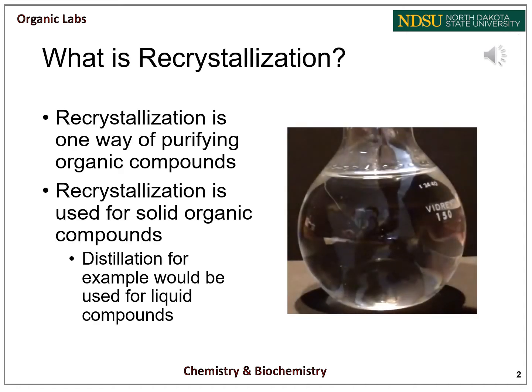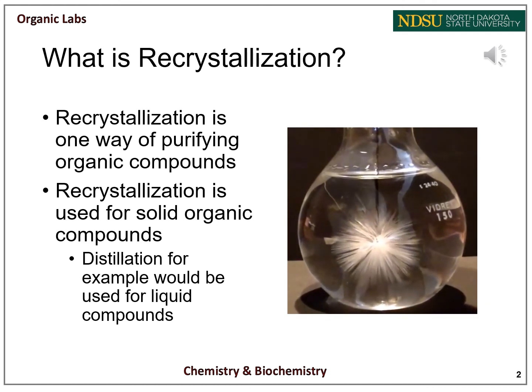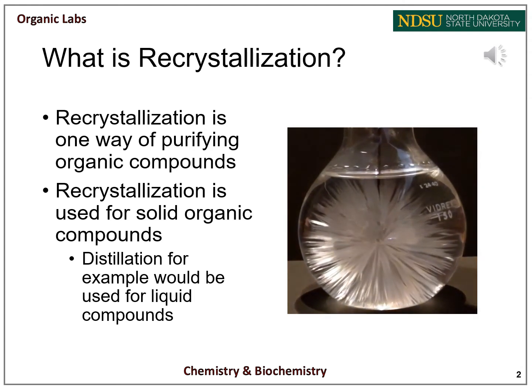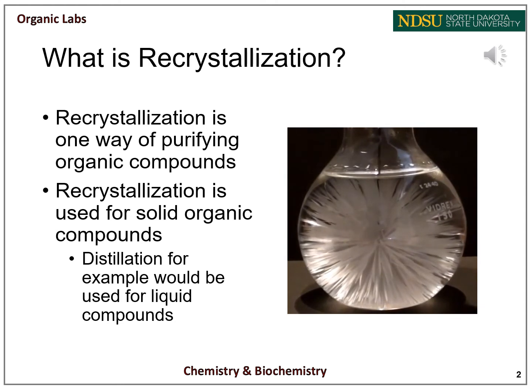So, what is recrystallization? Like I mentioned in the title slide, recrystallization is just one way chemists have to purify compounds, and specifically recrystallization is a method used to purify solid organic compounds. As an example, a way to purify liquid compounds would be something like distillation.